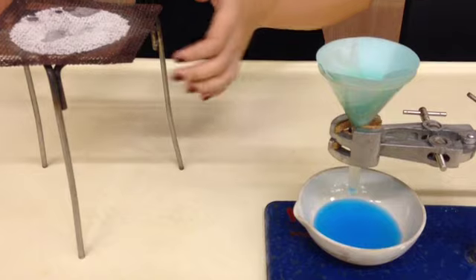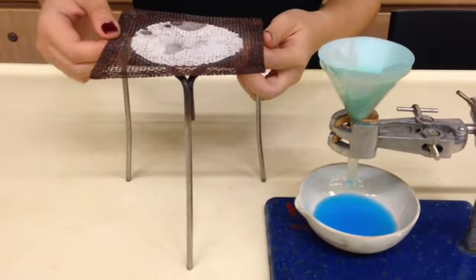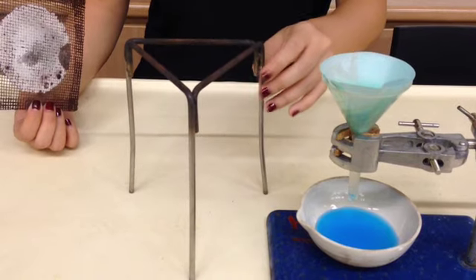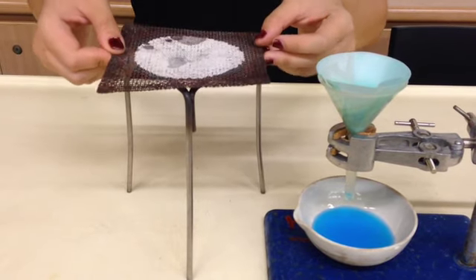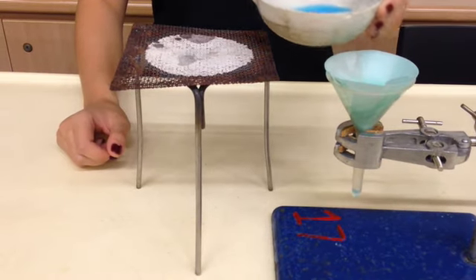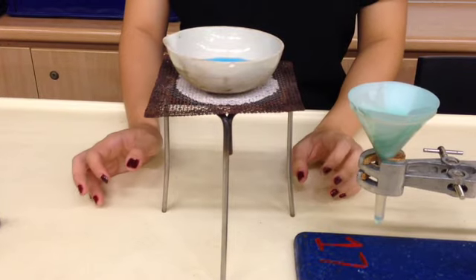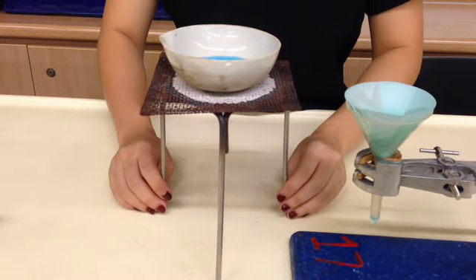When we do that, there are a few important things to take note of. Firstly, the apparatus. We have this thing called the tripod stand, it has three legs. On top of the tripod stand, we put the wire gauze. Then we take the evaporating dish with copper 2 sulfate solution, and we put it on top of the wire gauze like this. Make sure that everything is stable, so that you don't have to touch it when you start heating.